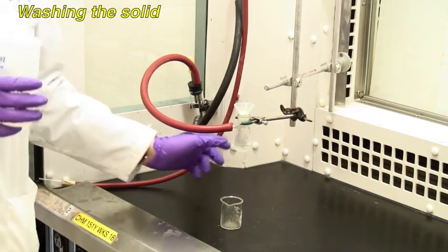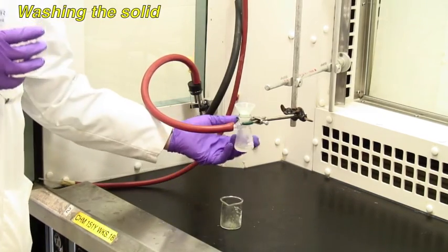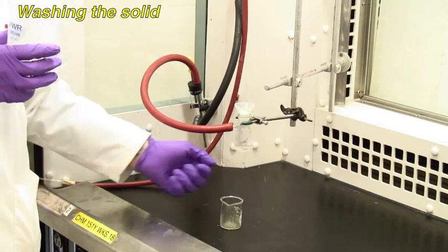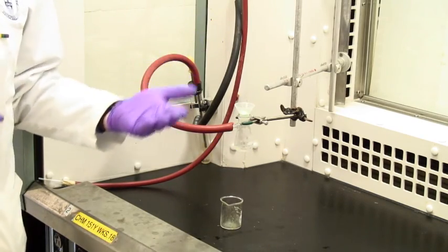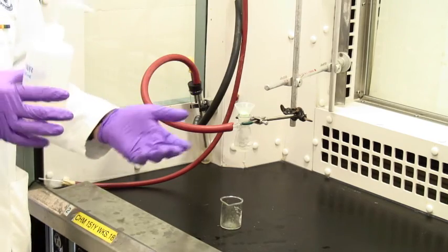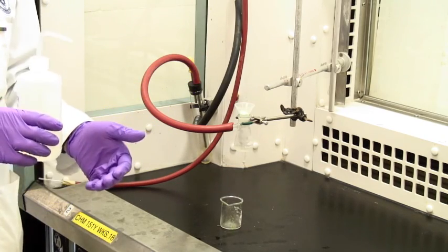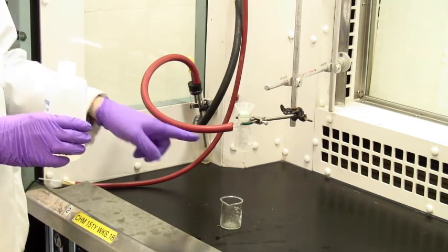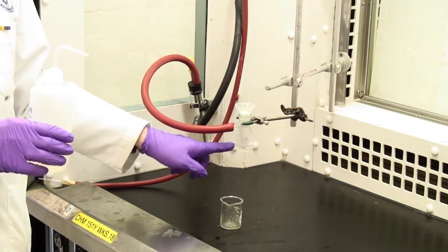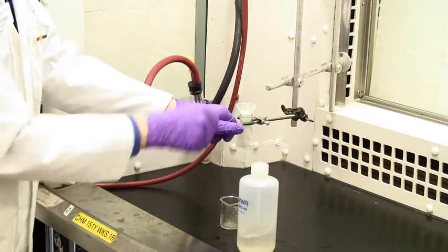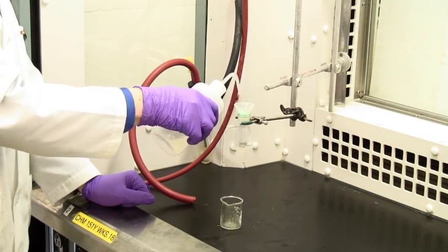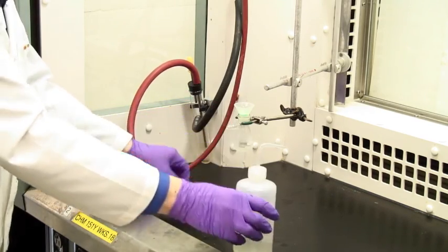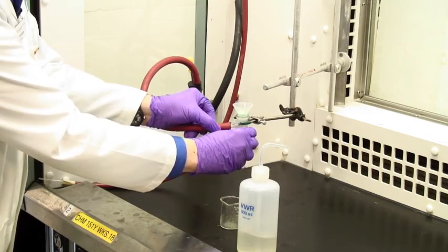Now you may wish to remove any traces of the filtrate and any dissolved species in it. The protocol may tell you to wash the solid on the filter using water or some other solvent. In this case, once the filtrate has passed into the flask, you disconnect the vacuum like this. You don't need to turn it off and add the wash liquid and then apply suction.